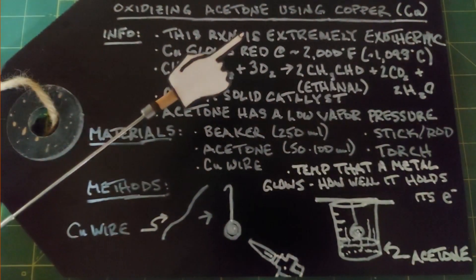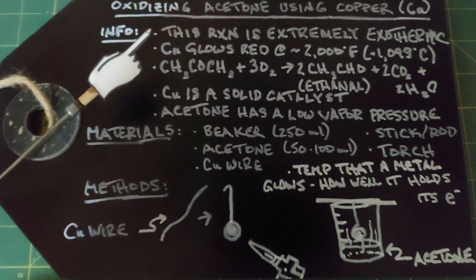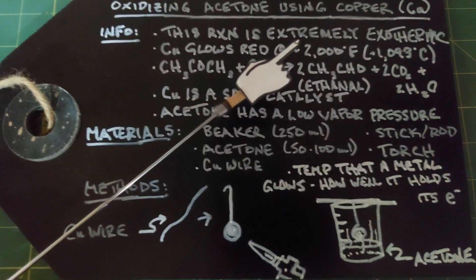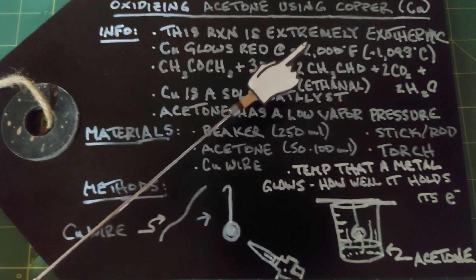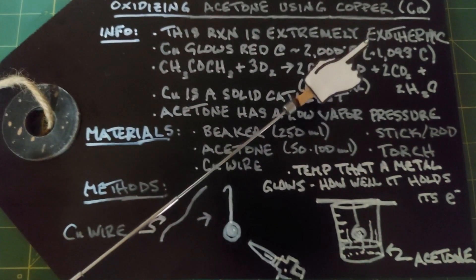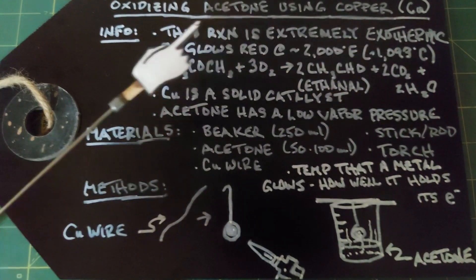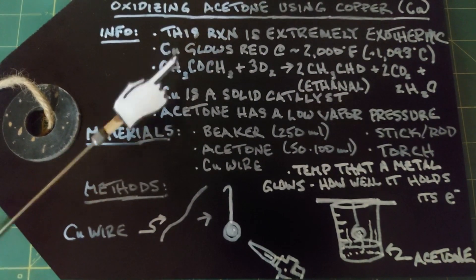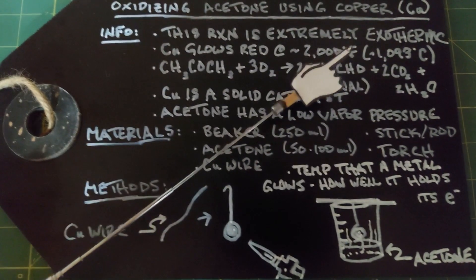In this video we're going to look at oxidizing acetone using copper metal. Some information about this reaction: it is extremely exothermic. Copper tends to glow red at around 2,000 degrees Fahrenheit or 1,093 degrees Celsius. The reaction is so hot that once you heat this with fire, the reaction will keep it glowing close to this temperature without adding any more fire.